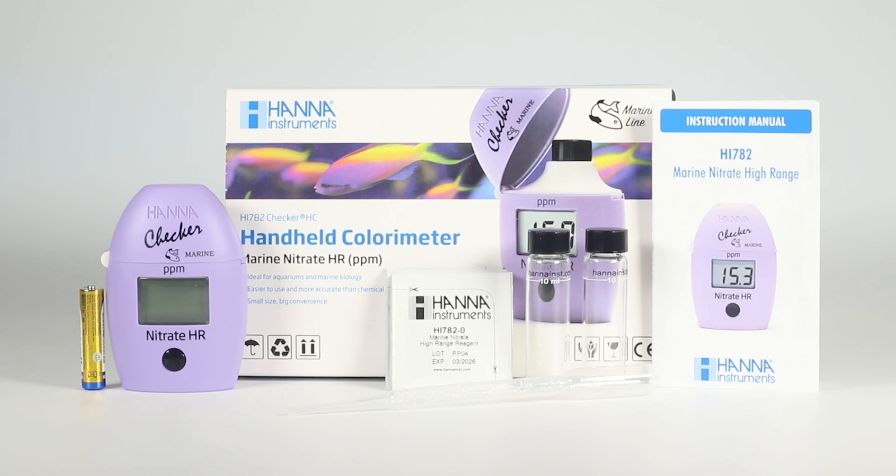Each HI782 is delivered in a case with two sample cuvettes with caps, ten test reagents, one 3-milliliter pipette, one AAA alkaline battery, and your instruction manual.